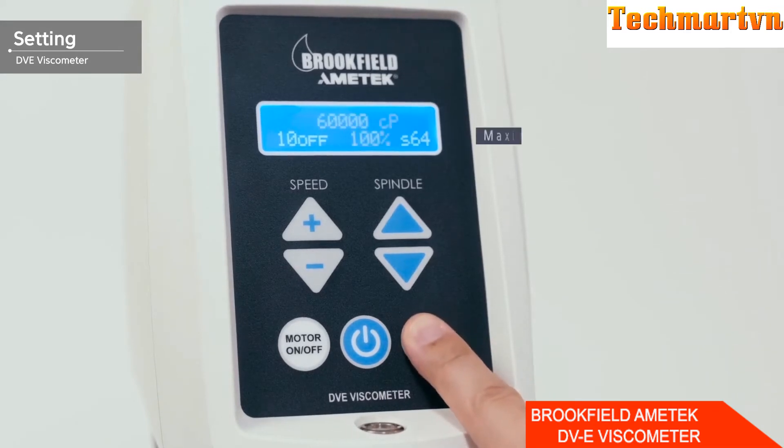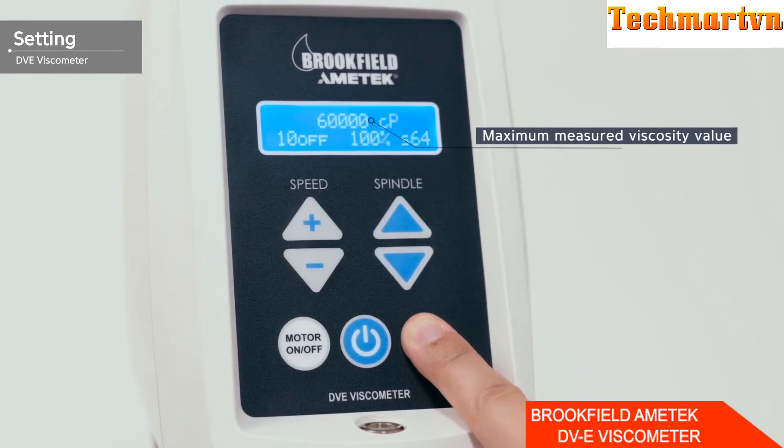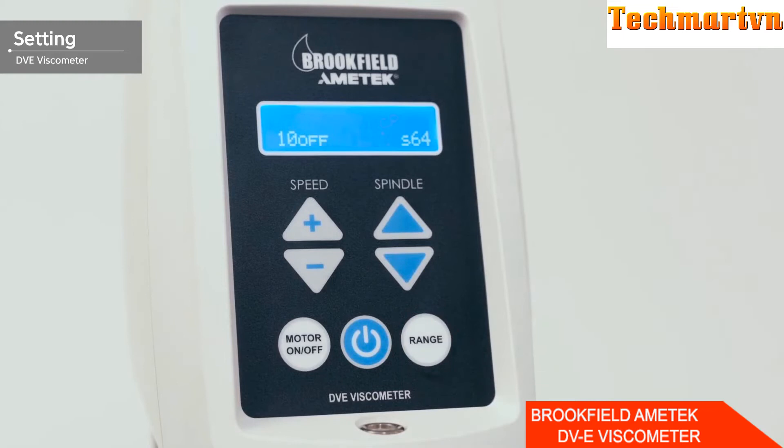Press the range button on the bottom right to see the maximum viscosity that can be measured under the current conditions. If the maximum measurable viscosity value is lower than the expected viscosity value, the RPM or spindle must be changed. If you do not know the expected viscosity value, first set the measurement range wider to see the approximate viscosity value, then narrow the range to measure more precisely.